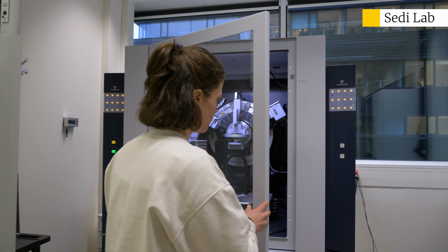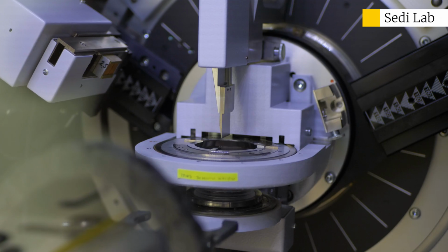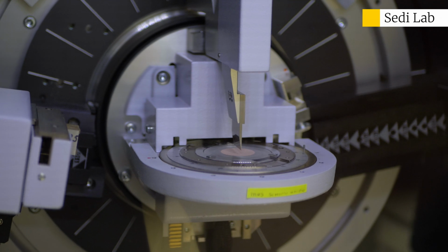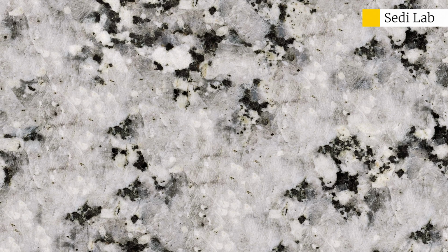What we do here is send copper X-rays to our samples, and then we measure how much of the X-rays diffract to the detector and then compare this with our database. This allows us to determine what kind of minerals are in our samples, for instance quartz or feldspars, clay minerals.